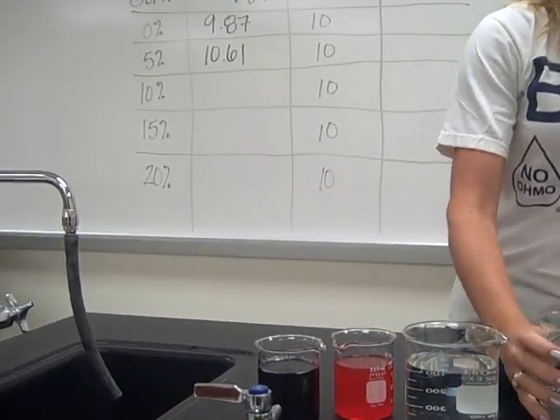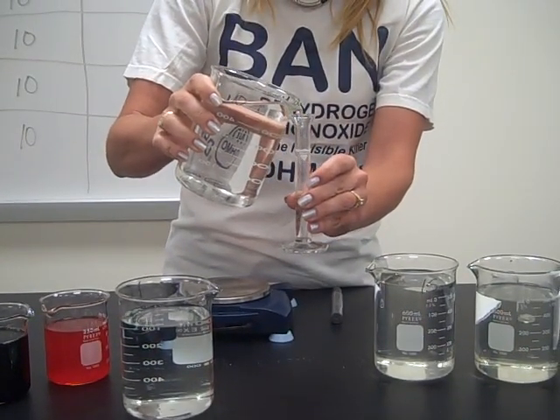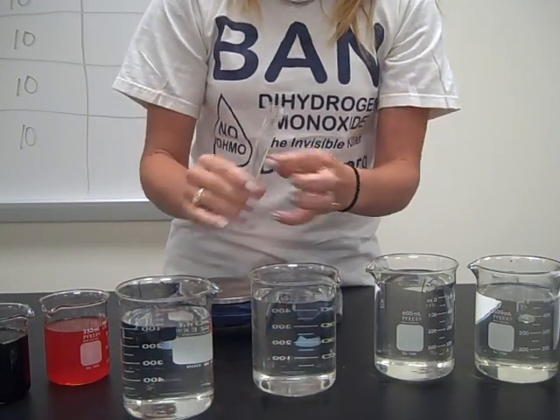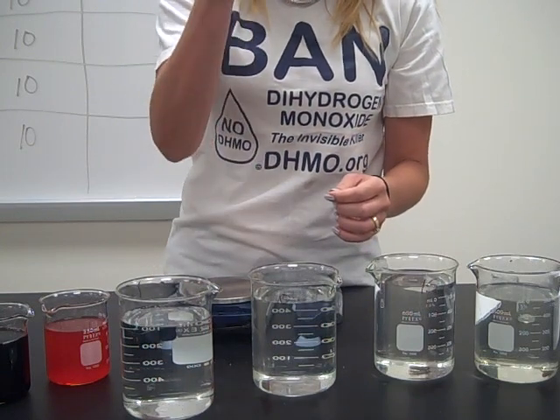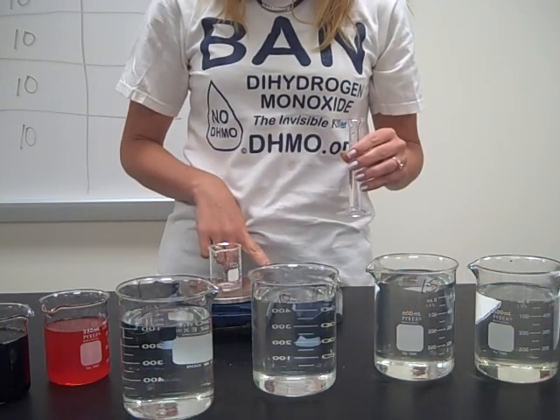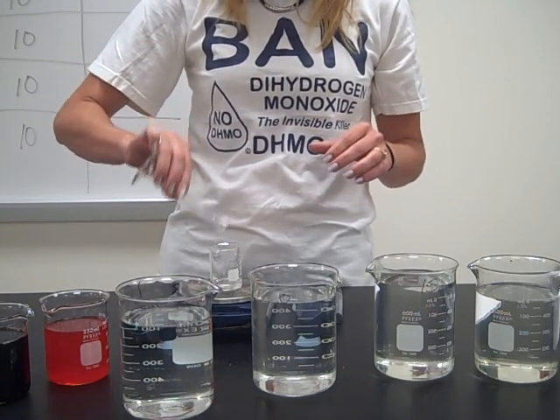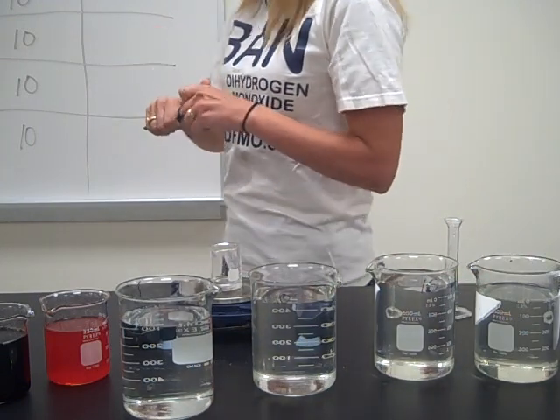Now I move on to the 10% sugar solution — this is 10% sugar, 90% water. I overshot it just a little bit, so I'm going to pour some of it back in. Put it on; probably going to have to zero it out again. Dump my 10% sugar solution in — and I get 10.39.